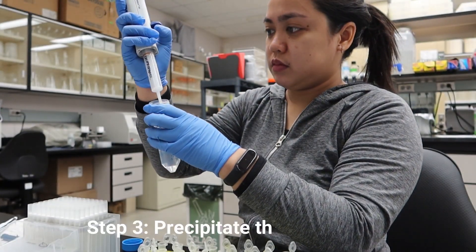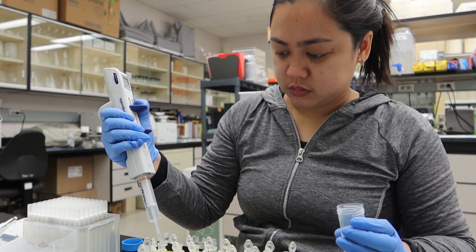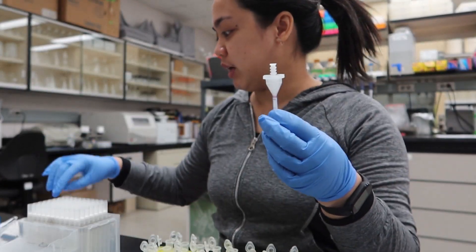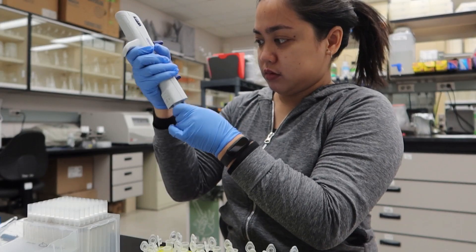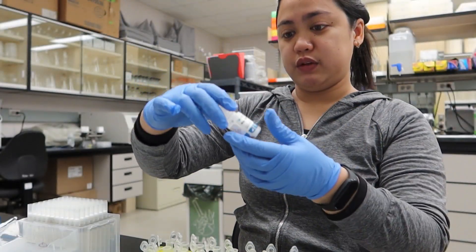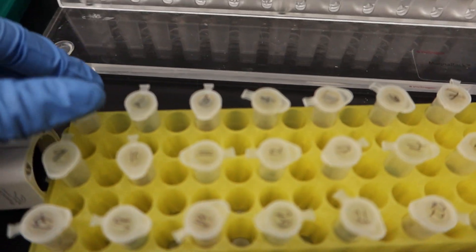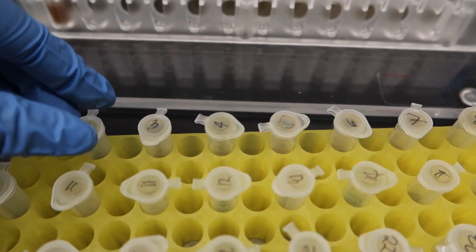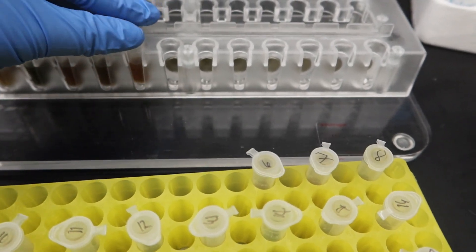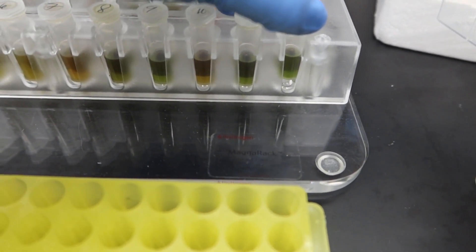Step 3: precipitate the DNA with an alcohol. Dito, we added isopropanol. Yung na-experience ko kasi ice cold alcohol. So dito sa kit na to, gumamit din ng isopropanol. Instead na mag-precipitate lang ang DNA para maging visible, dito naglagay pa tayo ng magnetic beads so that doon didikit ang DNA habang nasa procedure tayo. After nun, nilagyan natin siya sa magnetic plate. Let it sit for about 5 minutes, then mag-clear na yan. Clear na yung liquid and nasa gilid yung bead.